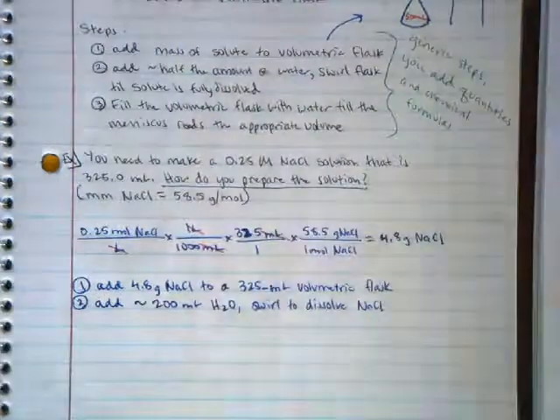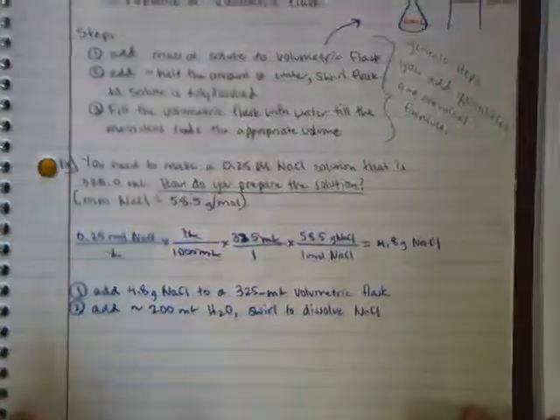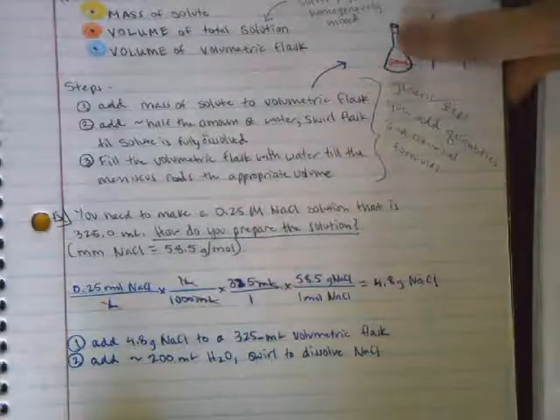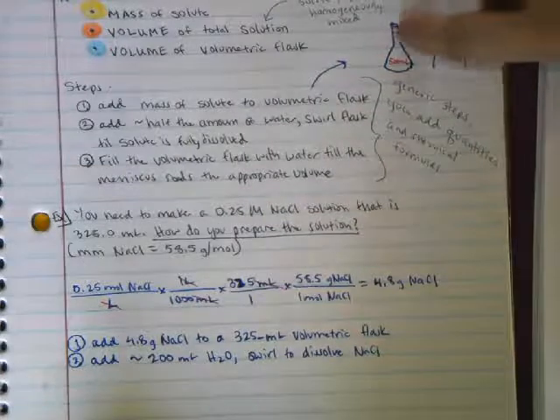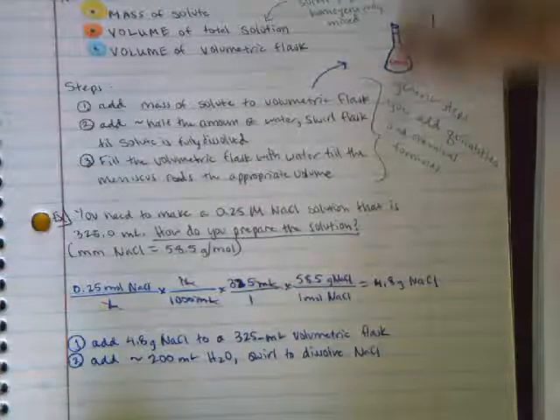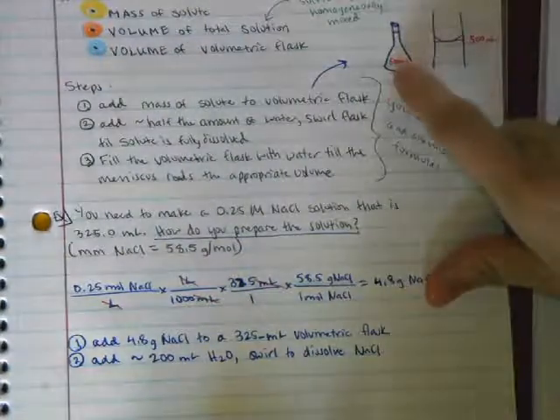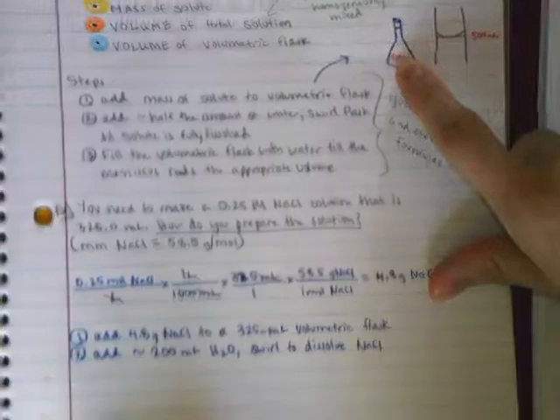Some things you want to look out for when you're practically making this solution. If when you're adding your solute, some of it gets trapped on the side of the neck on the inside, make sure when you're pouring your water that it grabs that solute on the way down. You just want to make sure that everything makes it down to the barrel of the volumetric flask and that the salt gets fully dissolved.